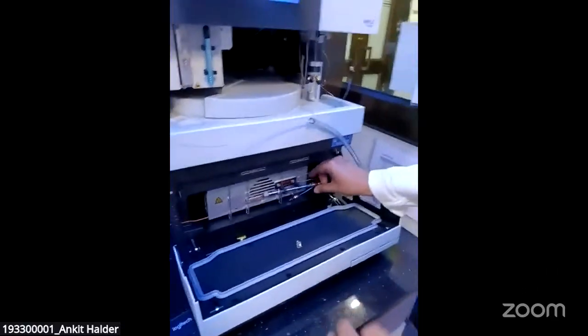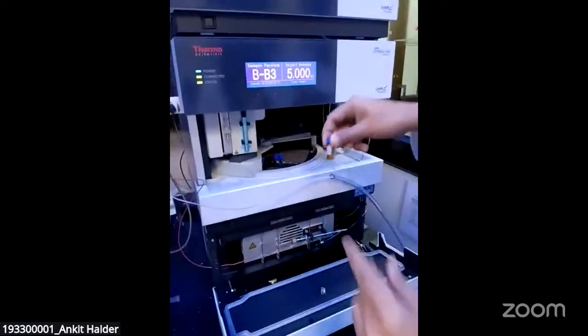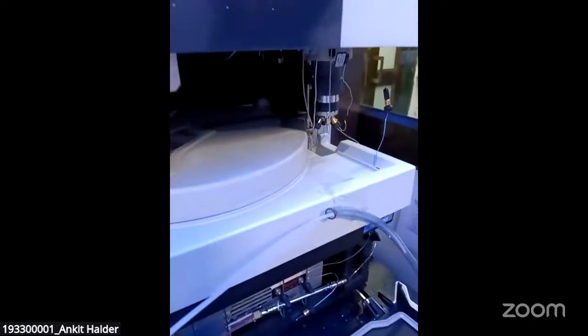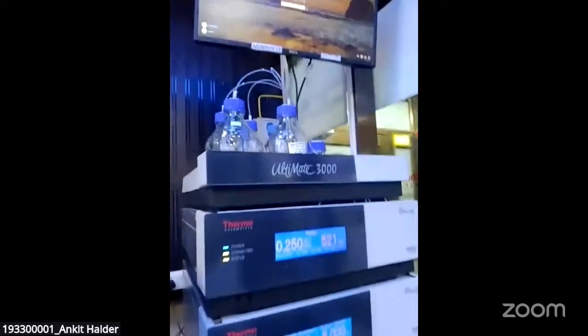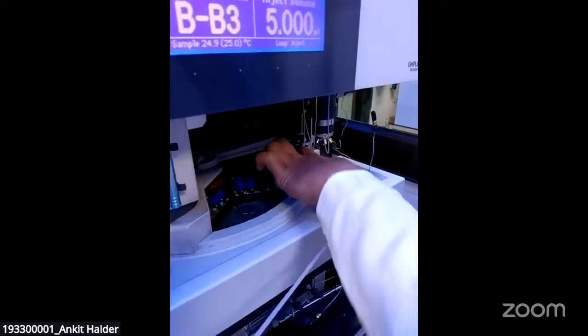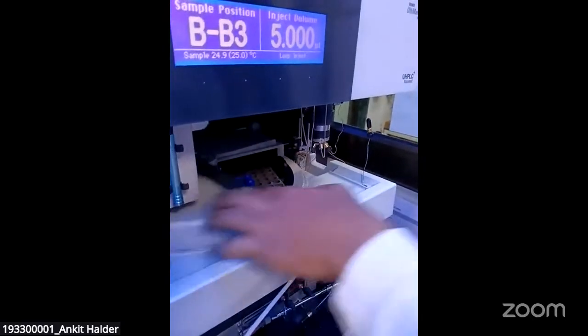So we just keep our samples here. When we keep our samples here and place the command for the sample, it takes the sample, takes our injection volume, and puts it in the particular path where it will be fixed.